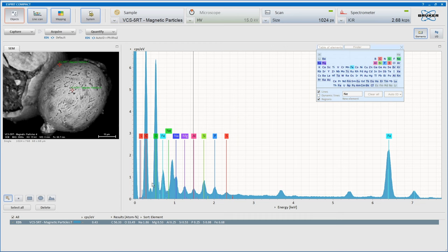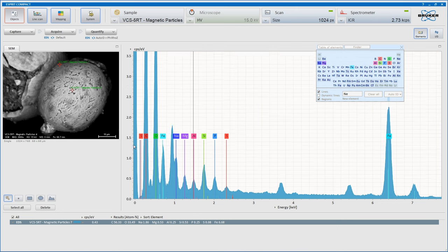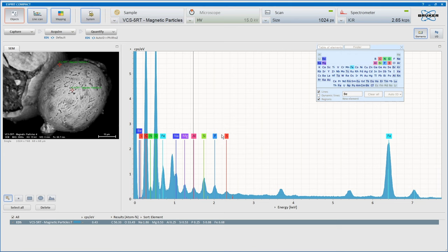Neon, is there a blip there? Maybe there's a shelf on that. It does appear to be a little shelf, but we wouldn't expect it there. Nitrogen, yeah, it's got all of the elements. What have we got here? Is that boron? No, there is no boron. Beryllium? No. Yeah, I'll put it in there. No, it's not there.